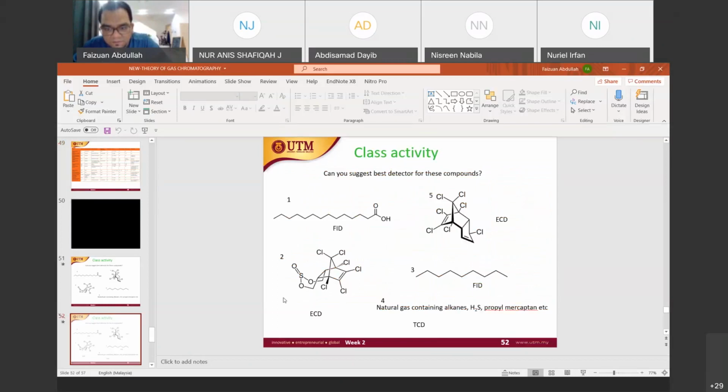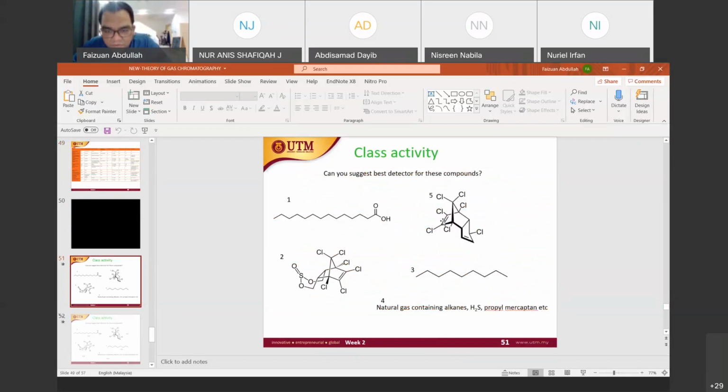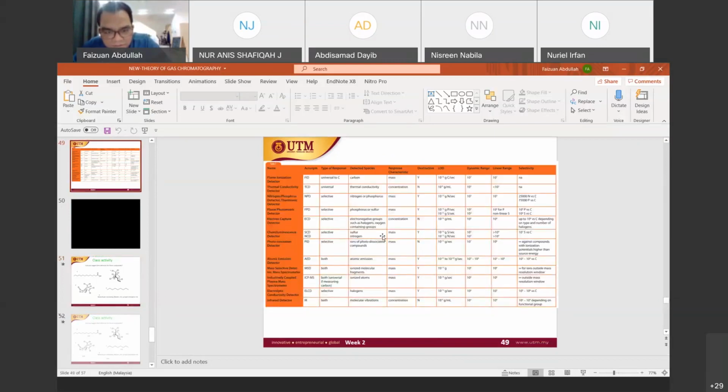And number 5, we use ECD. Why? Because ECD is suitable for electronegative compounds such as halogens. So if we have halogens, normally we use ECD for detection. All right. Okay, that's all for today.